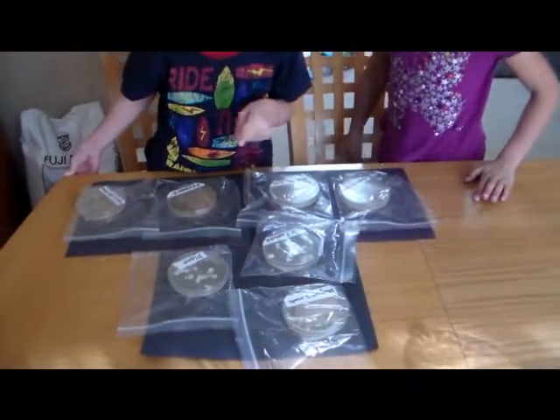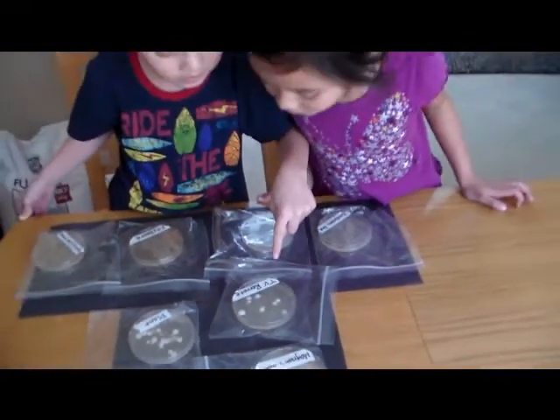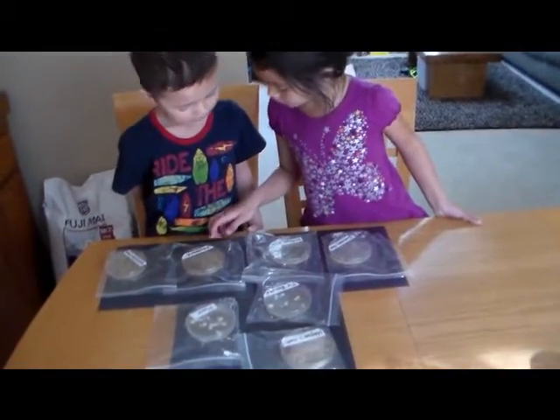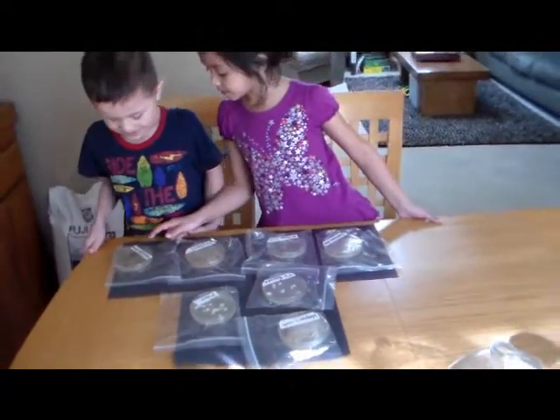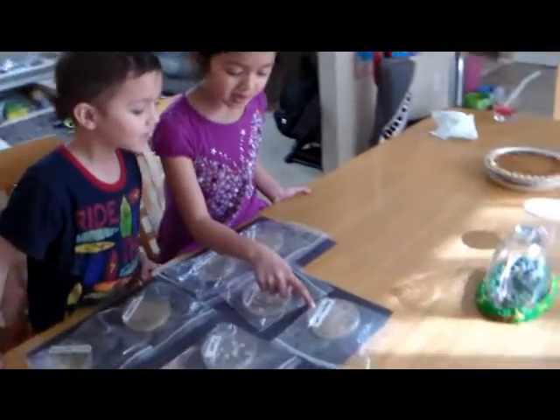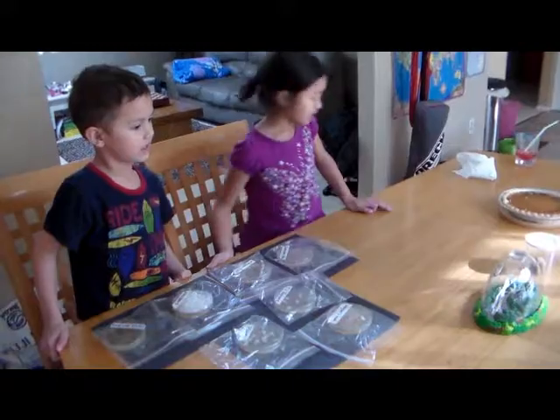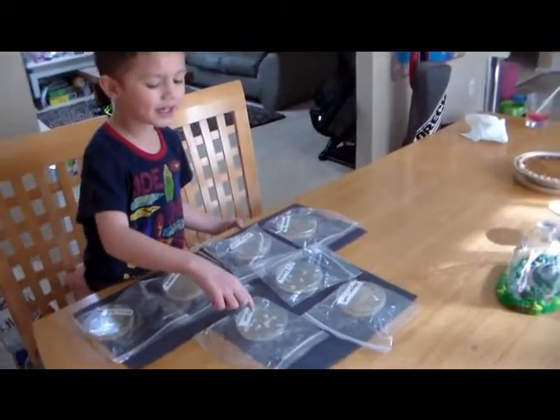You can see the labels so you can read where each specimen or bacteria was swabbed from. TV remote, bathroom sink — ew — kitchen sink — gross — keyboard, Mom's cell phone, plant, and Magnum's mouth — that's the dog's mouth. Do you see the differences between each Petri dish? Some of them look different from the others.